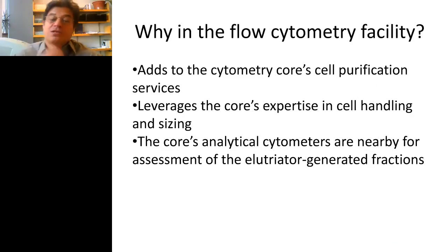So why do we want to do this in a flow cytometry facility? That gets back to the poll that we took earlier. I think about a third of the folks are operating in core laboratories. These exist in a lot of academic centers, and they're really a repository for knowledge and for the ability to have expertise in a certain field.